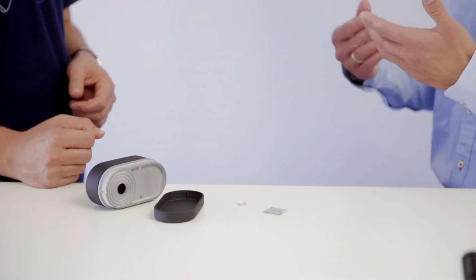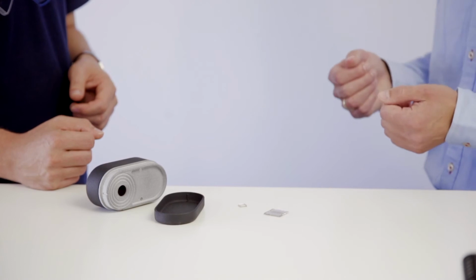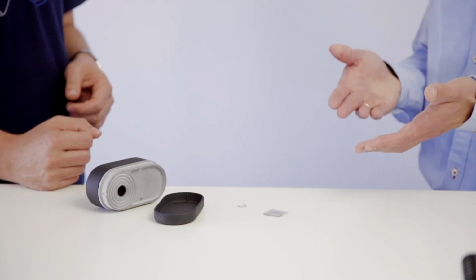And you can go even farther. You can implement this technology basically into a smartphone. So this technology with all your USPs you mentioned is able to get implemented into a smartphone. And then you can imagine the applications which are possible. They are endless. Of course, we have to say that it's not only a question of hardware, it's also a question of software, a question of algorithms, how do you do the chemometric modeling? And we touched upon all of these questions in other videos, so feel free to have a look.